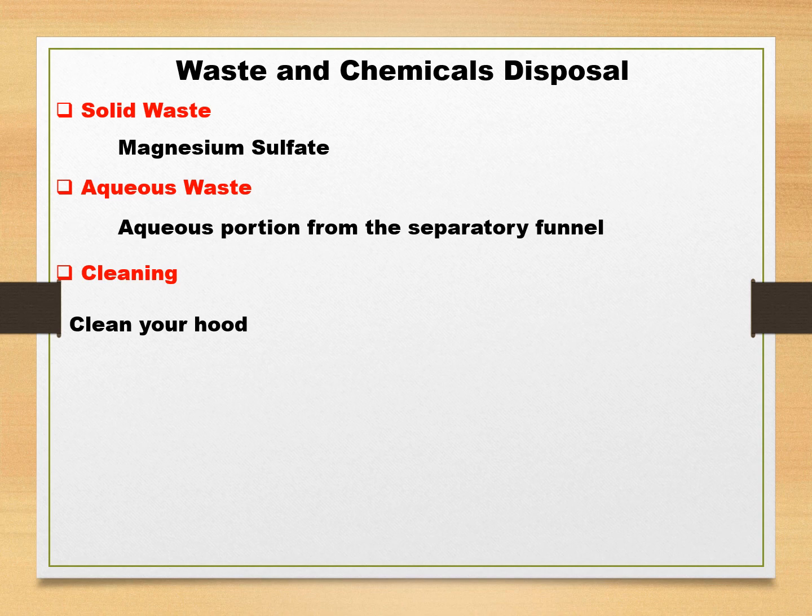Well, one of the important issues to remember about safety in every chemistry lab is the waste disposal, and the magnesium sulfate, which we use to dry our sample, is now a solid waste, whereas the sodium benzoate salts, which we remove by dissolving in aqueous solution, are all going to be aqueous wastes, and we must do the experiment in the fume hood. I mean, it's expected that we were doing the experiment in the fume hood, and we have to make sure to clean the hood at the end of the experiment.